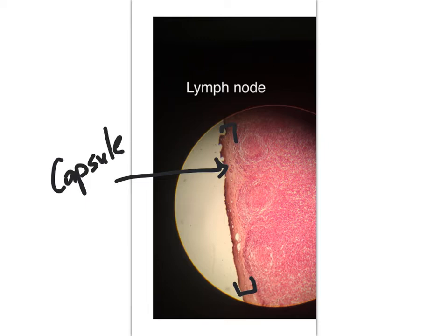Okay, now the cortex, again representing an outer structure. The key for the lymph node and the cortex are these circular structures here. Okay, so you will see these somewhat circular structures here. They're called germinal centers, but wherever you find these germinal centers, this section, this whole strip here, this would represent the cortex.